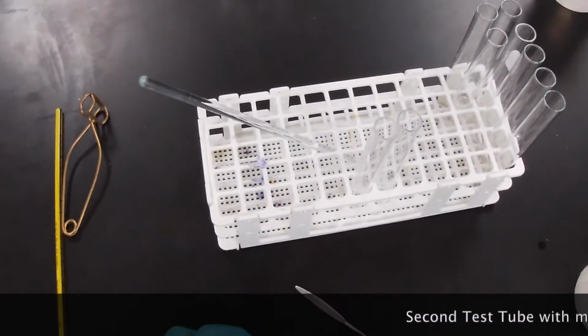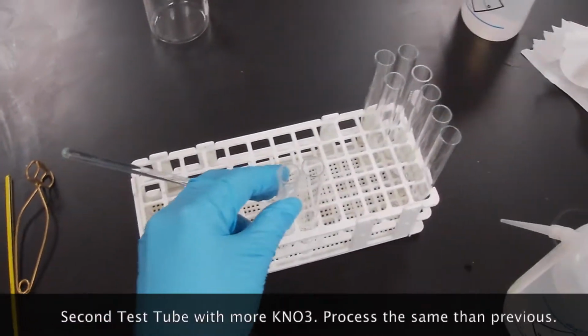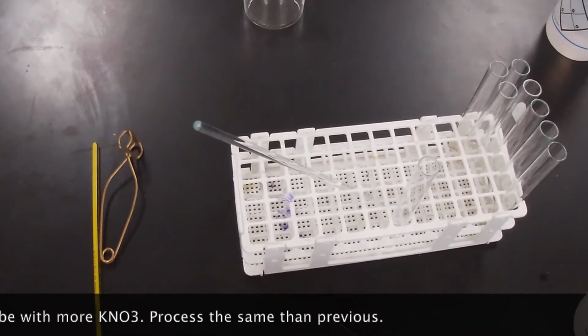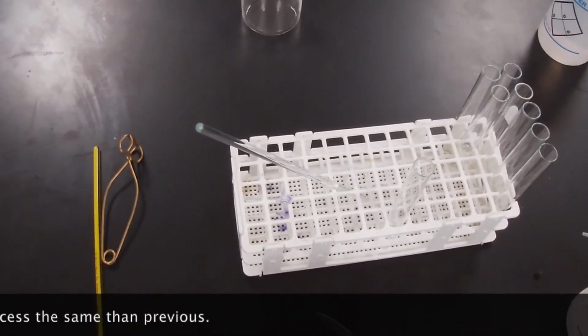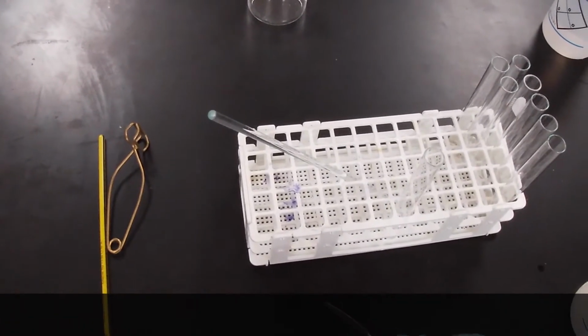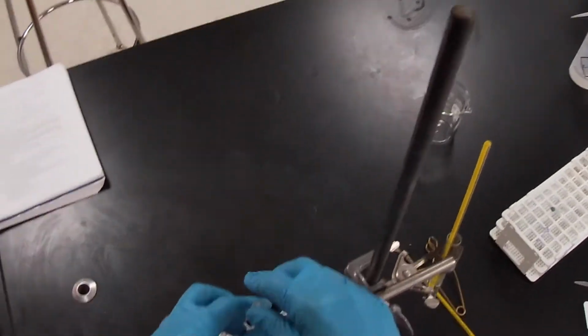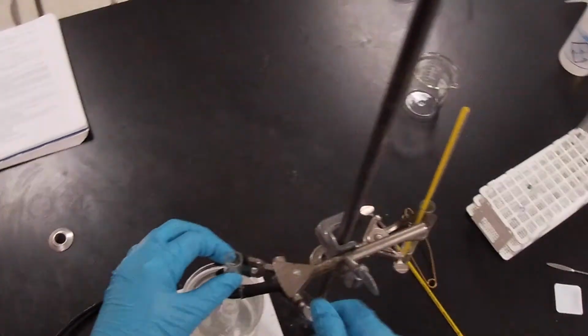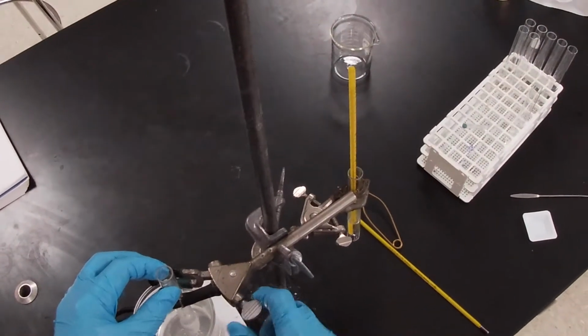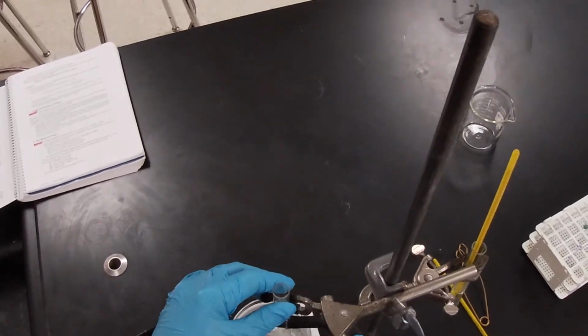So now we're gonna go ahead and get our 4 gram sample while we wait a little bit to cool. We're gonna get our 4 gram one, and we're gonna place it in our test tube with 5 milliliters of water. Try to get everything in there. Okay, and we're gonna set it up in our next container here, and place it in there. I'm gonna try to lower it a little bit. Gotta make sure that everything is submerged.